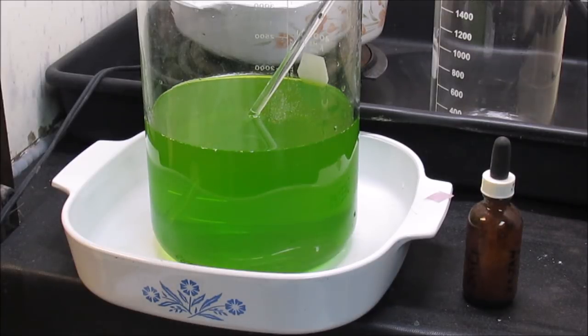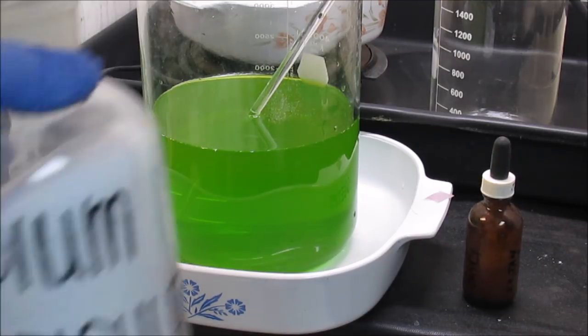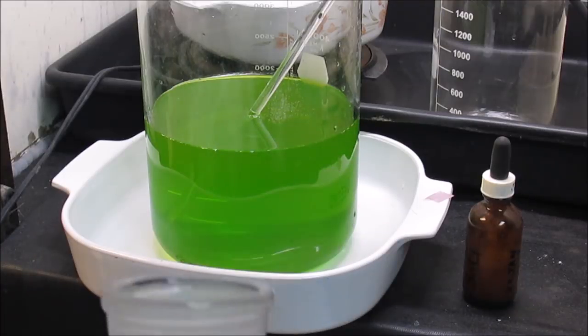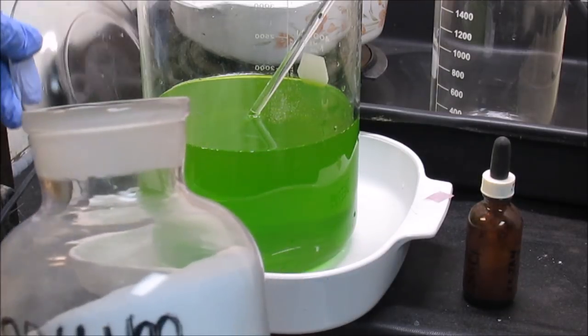Started to precipitate, then it went right back into solution. So I'm going to add some more sodium metabisulfite, see if we can get it to come out of solution and stay out of solution.